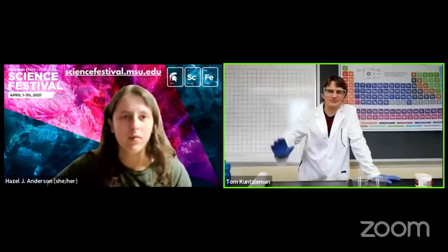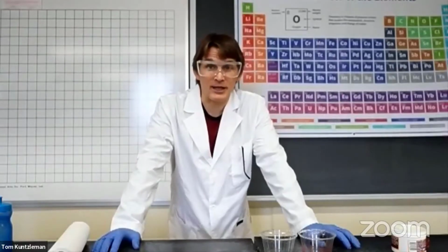Hi, folks. Welcome to this presentation at the Michigan State University Science Festival. My name is Tom Kuntzleman, and I teach chemistry at Spring Arbor University in Michigan. We're just about 45 minutes south of everybody in East Lansing. And this afternoon, I'm going to do some experiments with the element copper.